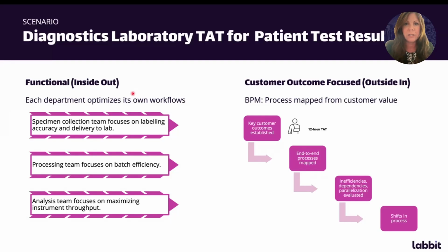longer than expected. Now, on the right-hand side, we look at a customer outcome-focused or outside-in approach. Here, we start with the patient's expectation or the value driver for the customer, in this case, turnaround time.